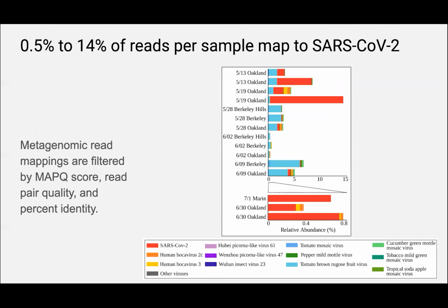And it's interesting, there's a lot of sample-to-sample variability that doesn't necessarily relate entirely to just how much there was in the sample. With qPCR, we know that a lot of times the qPCR results say that the viral load is quite consistent, but you can have very different amounts of sequencing results, and it can depend probably on the other contaminants in the sample and how the library preparation went, I suppose.